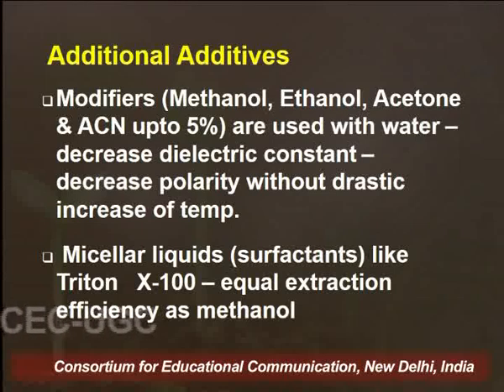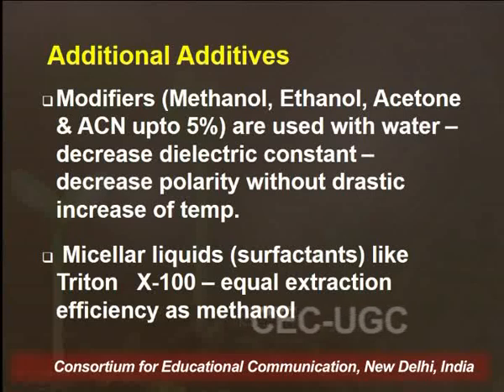It has been found that Triton X100 has almost similar extraction efficiency as that of methanol. So obviously we can always go for surfactant liquids because they are much safer in comparison to the organic solvents.